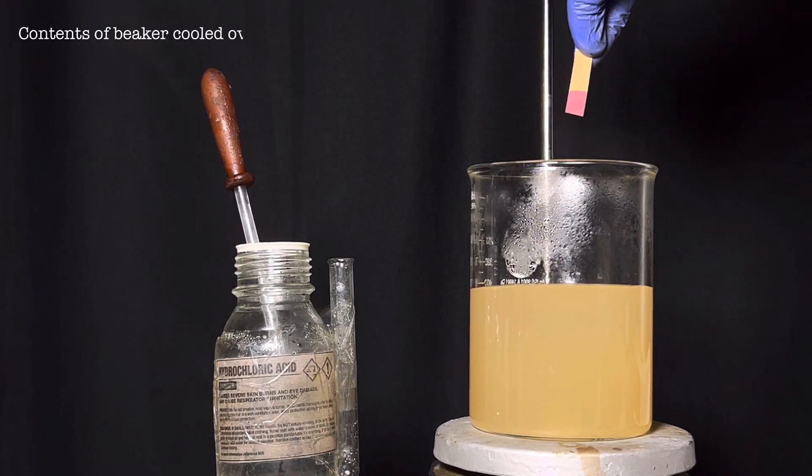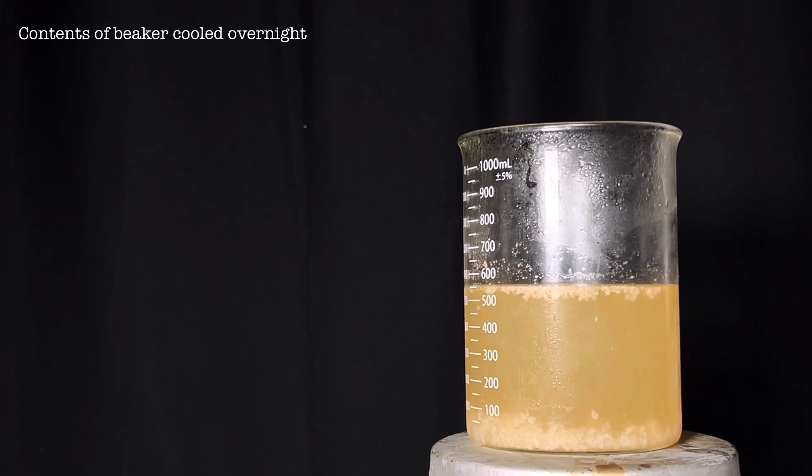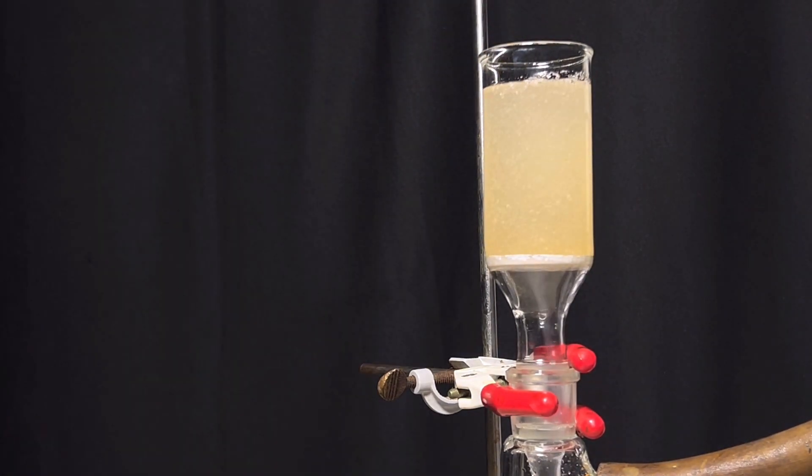The beaker was then chilled in the fridge overnight. Next day we have a lot of white fluffy precipitate and this is the crude cinnamic acid. It was then vacuum filtered to collect the crude product.